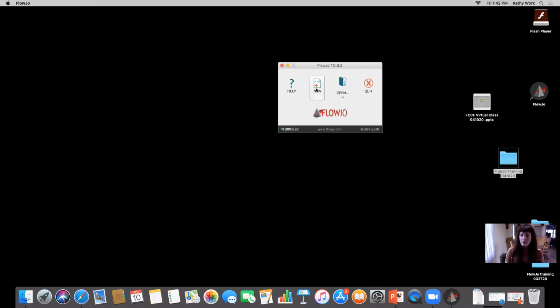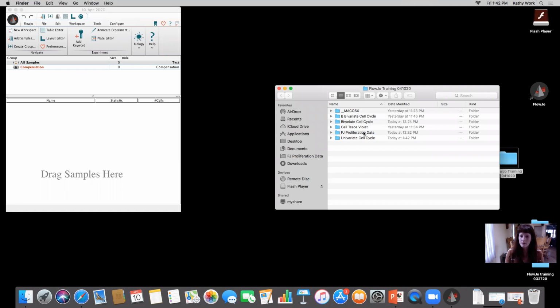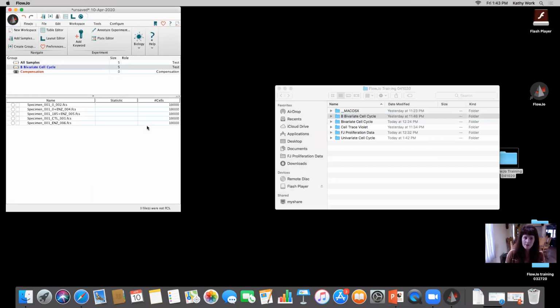Okay, so next we're going to go over some bivariate cell cycle data. So I'm going to open up this folder again. I'm going to drag in some bivariate cell cycle data. Okay. Now, when I bring this in, I'm not going to analyze all of these samples, okay? I'm just going to analyze one or two because I want to show you an important point here.